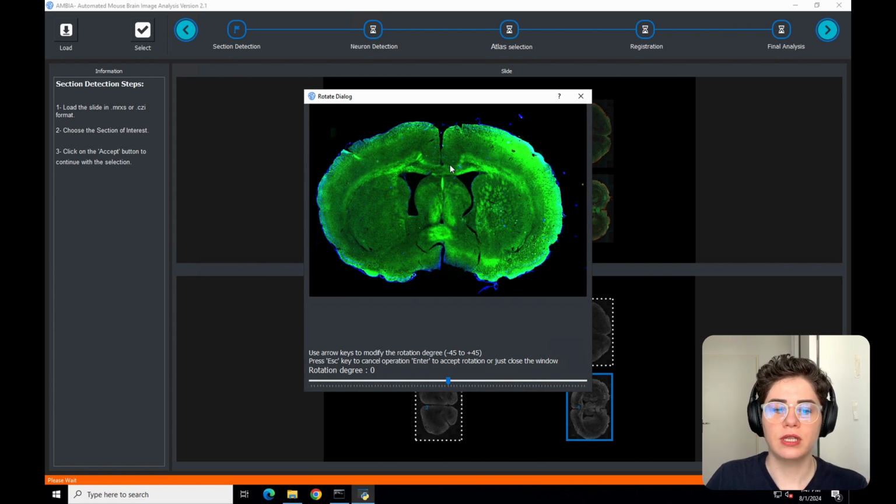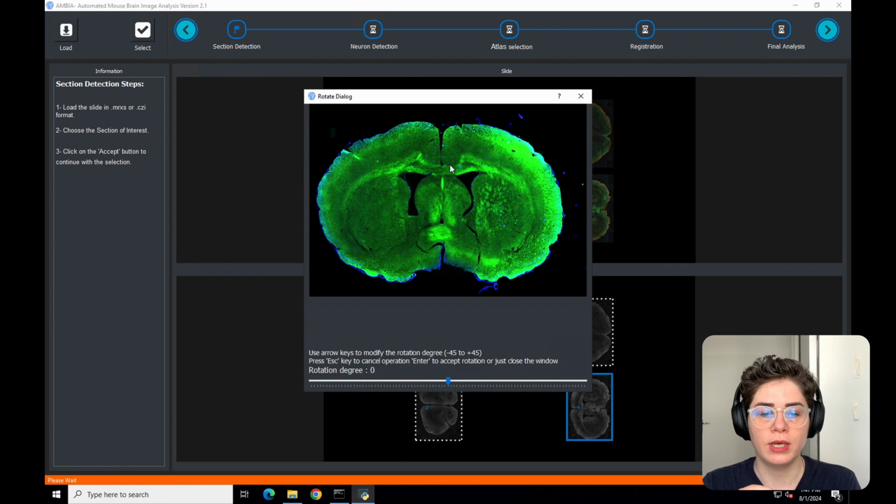After you click close, then you have to wait a bit because in the background, it's extracting PNG files on different levels. And this might take a while depending on your system. And you see, as I mentioned, while it's orange, this means you should wait.